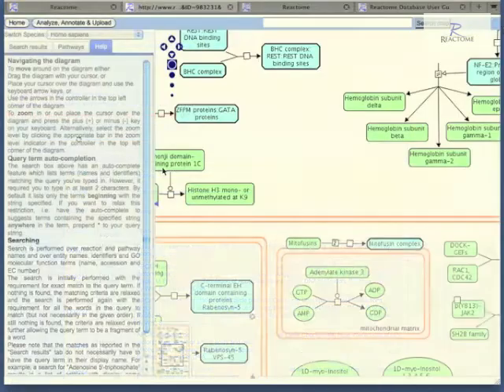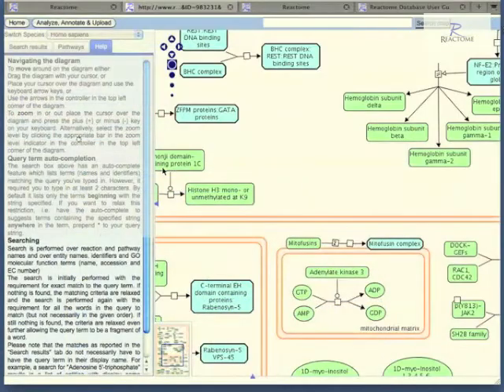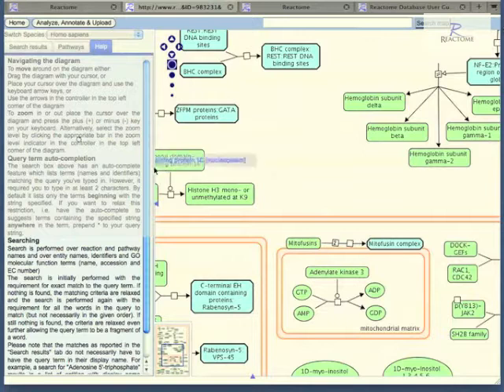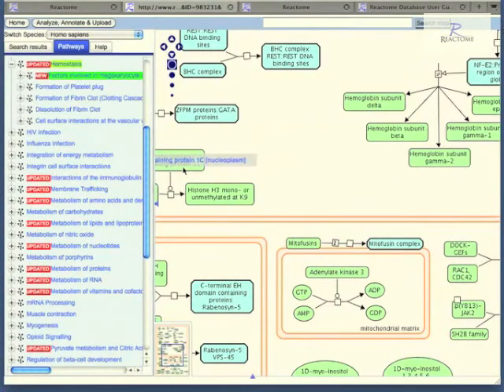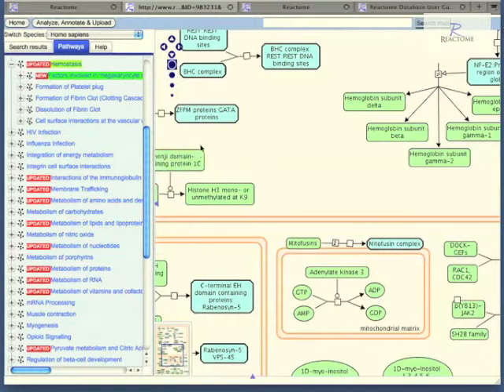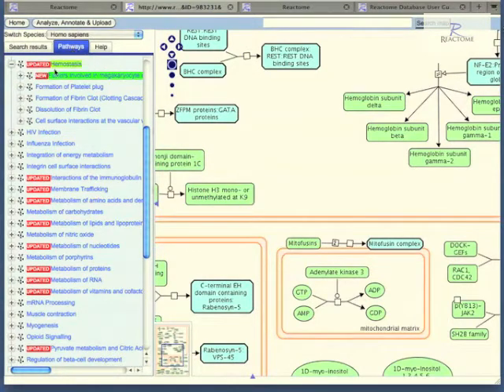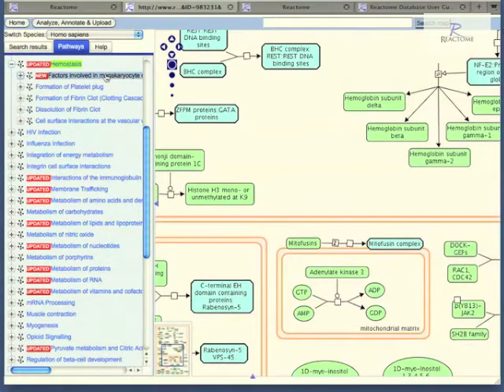Clicking on a pathway name will take us to the Reactome entity level viewer. The entity level viewer has a number of panes, a hierarchy on the left which will immediately select the pathway that you clicked on, and take us to that diagram, the window on the right.